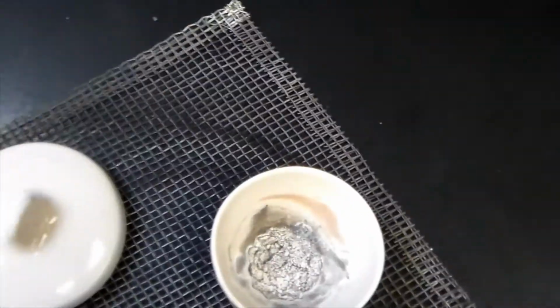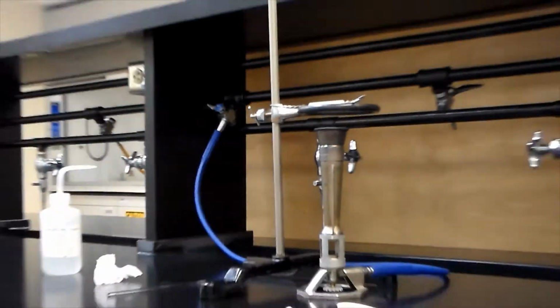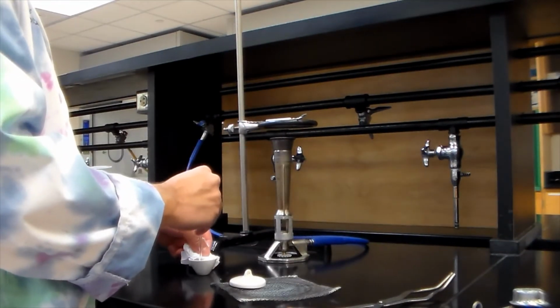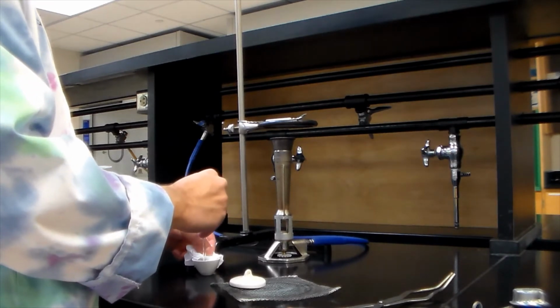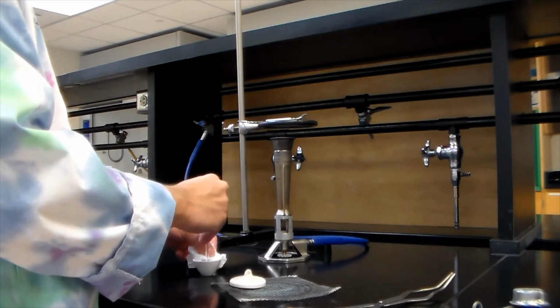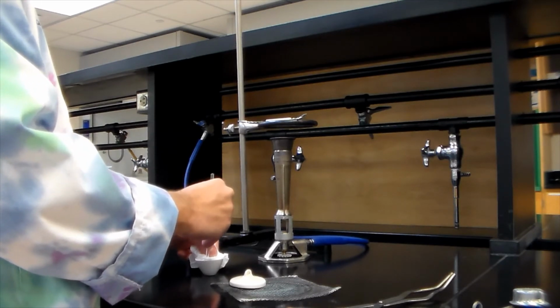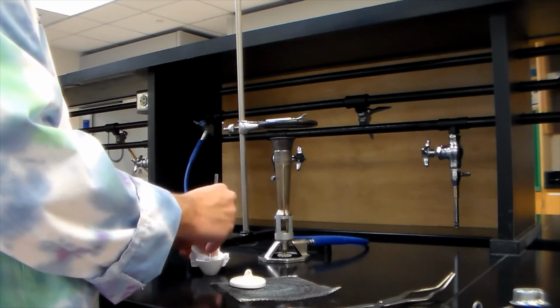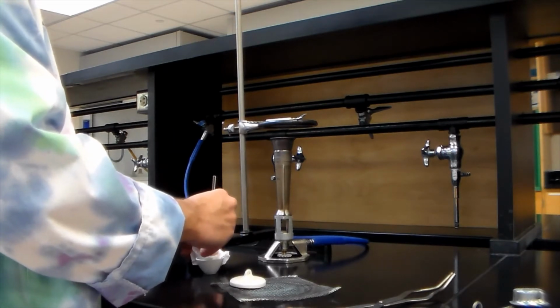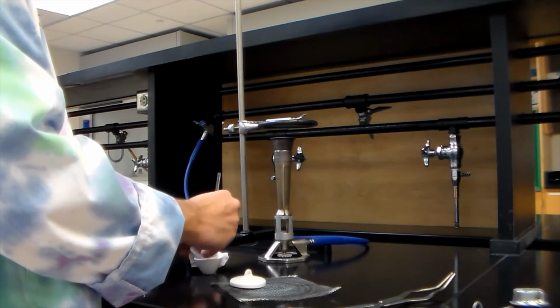Using a glass stirring rod, carefully crush the pieces of magnesium into a dark gray powder. This powder is a mixture of magnesium nitride and magnesium oxide. If any unreacted pieces of magnesium remain, heat the slightly open crucible with a medium to low flame for 5 more minutes. Repeat steps 11 through 13 until all the magnesium has reacted and you have a uniform dark gray powder.